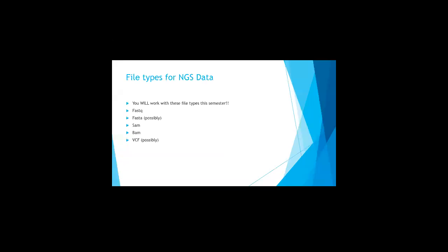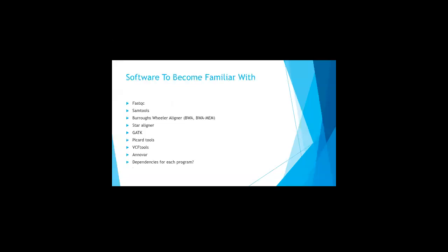I won't cover these because Dr. Liu did me the favor of doing all the heavy lifting. You will see these this semester. You will either work with them, you will generate them, or they will be provided for you. FASTQ files, you will see. Generating BAMs, that will happen. VCF files, they'll be provided because I don't think I'm going to take you all the way through the pipeline. That's not the plan for DNA-seq. But we are going to do part of it. There are pipelines that I also want to show you for this work, but we'll talk more at length when we get there. Lots of software that you're going to use as the semester unfolds, okay?